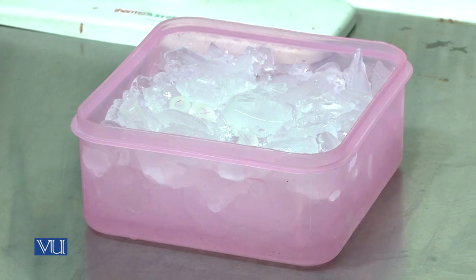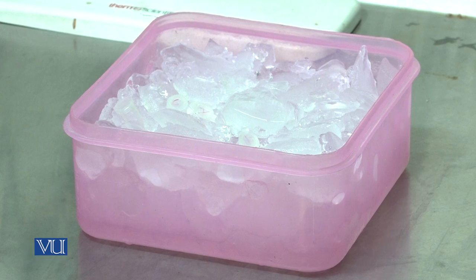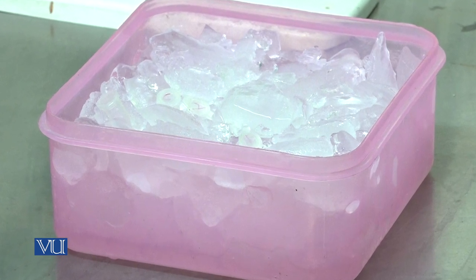So we start our experiment. We need two things first. Number one, competent cells, which are already prepared and stored on ice or at 4 degrees centigrade. And number two, our DNA of interest, which is plasmid in this case.